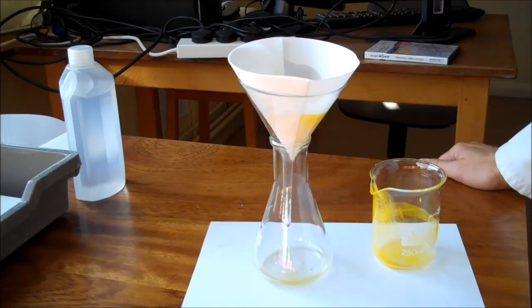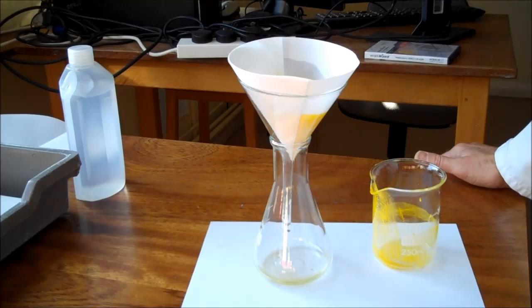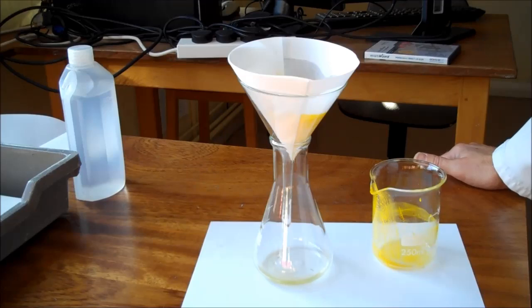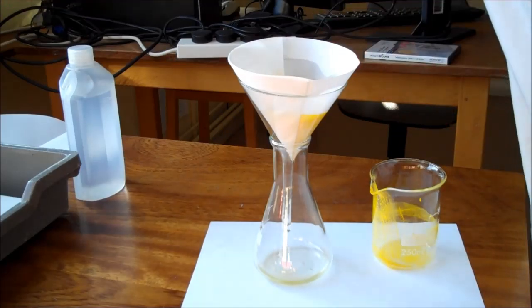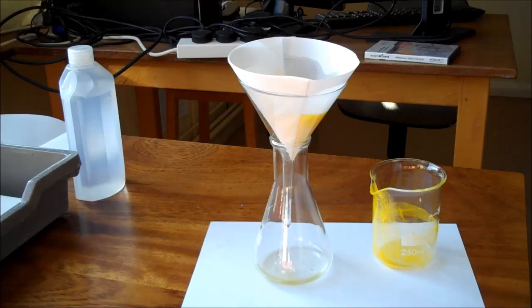This technique has some useful everyday applications. One would be to identify different dissolved ions. For example, if I thought I had lead ions dissolved in a solution I could add a few drops of potassium iodide and that would immediately give that bright yellow precipitate. That is a characteristic test for lead ions.